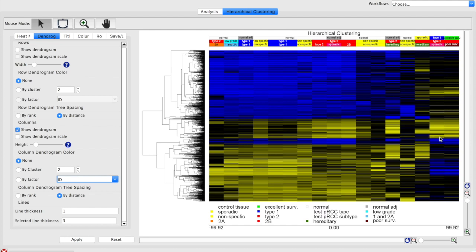So these are what I'm going to find are going to be some of the interesting clusters that we're going to pull out. What are the differences between these two different types of cancers? Can we characterize the different forms of cancers based on the patterns of expression that we're clustering here?